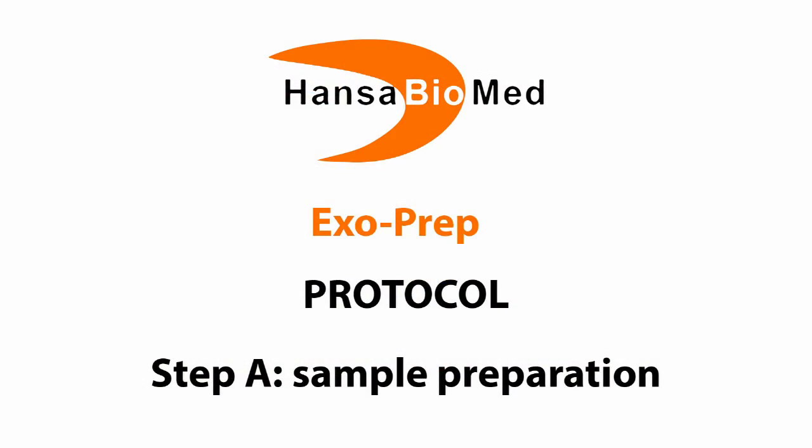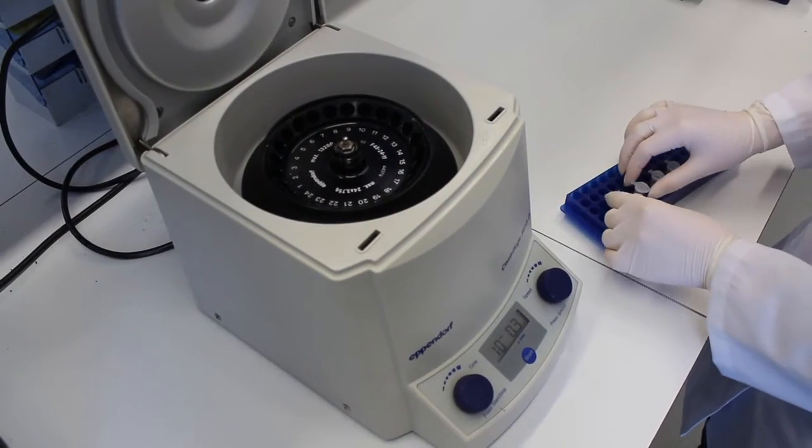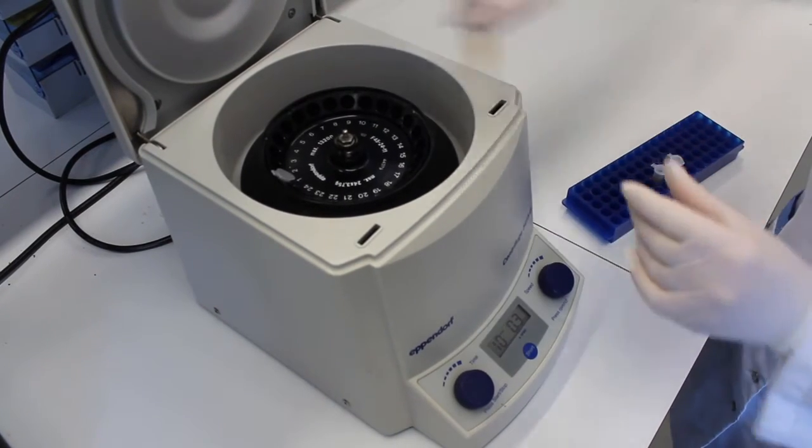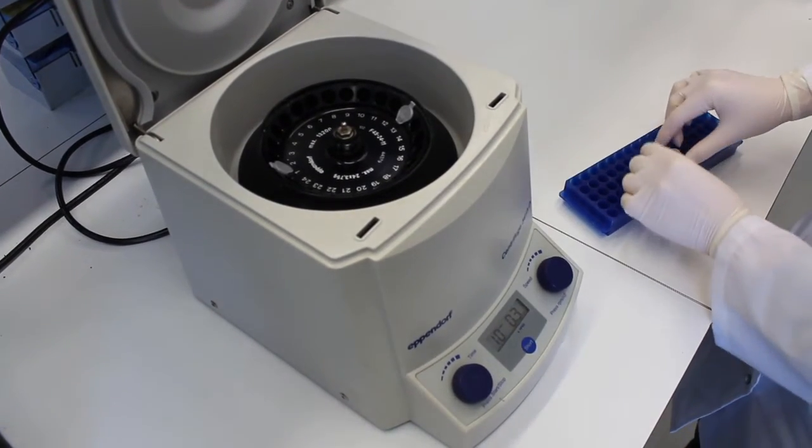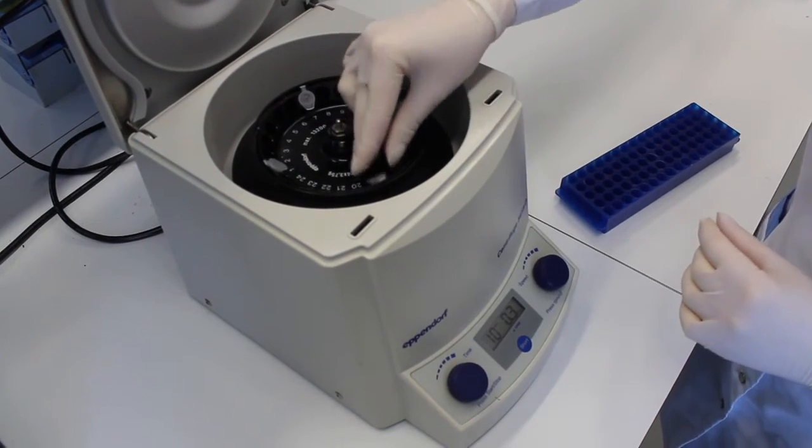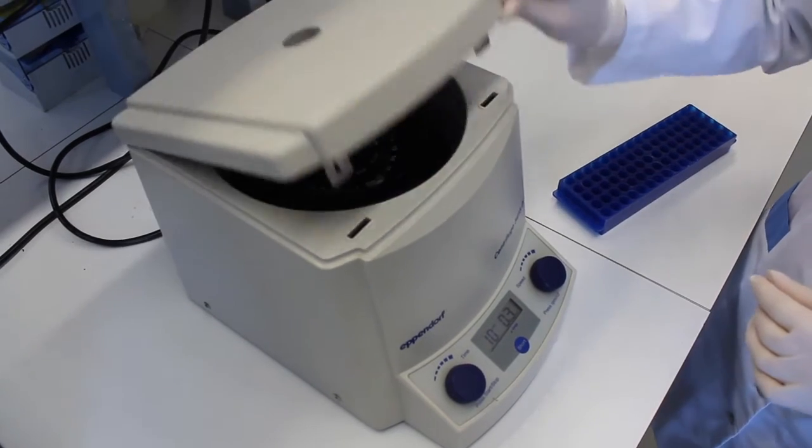Step A: Sample preparation. Prepare your samples by three centrifugation steps. First one 10 minutes at 300G. Second one 20 minutes at 1200G. And third one 30 minutes at 10,000G.